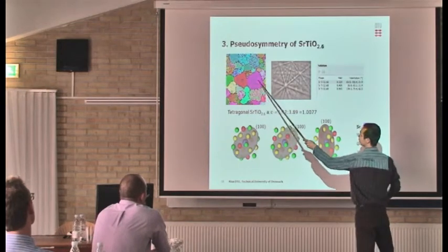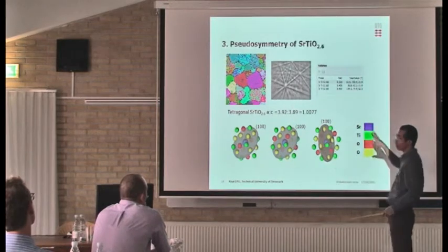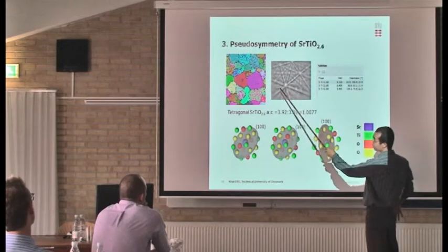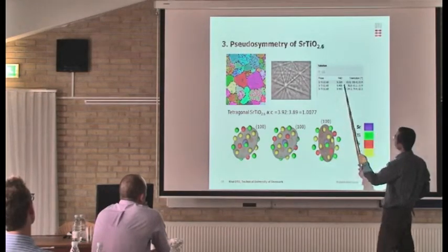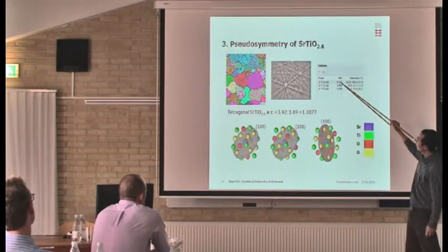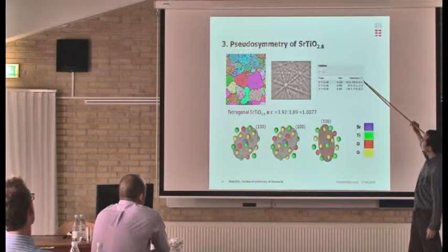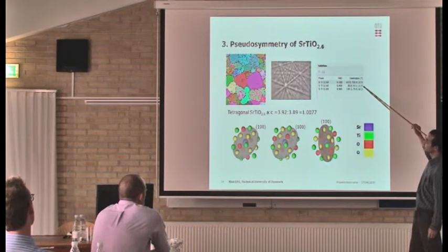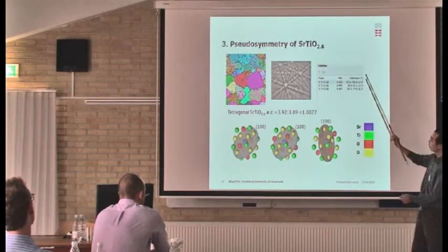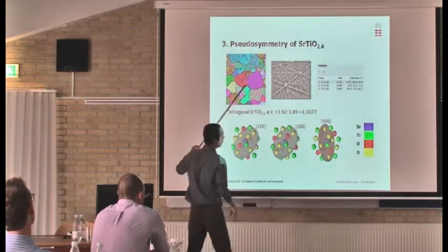Same grade. The diffraction pattern can be changed a bit. So when the pattern changes a bit, it can take effect on the match value. So this value can be increased, this can be decreased. So the answer can be changed from the first one to the second one, or to the third one. This is the reason of this noise.